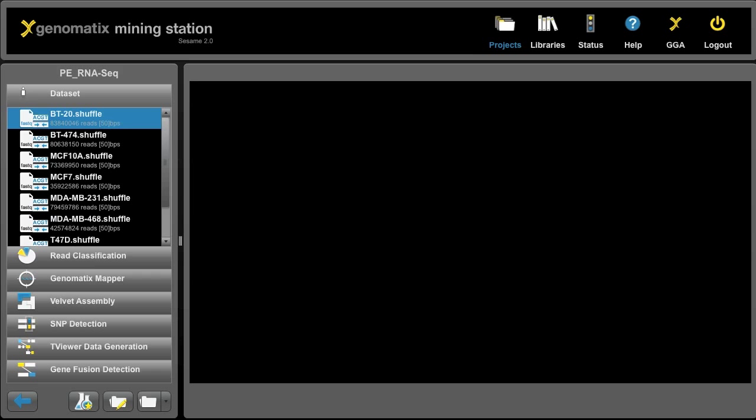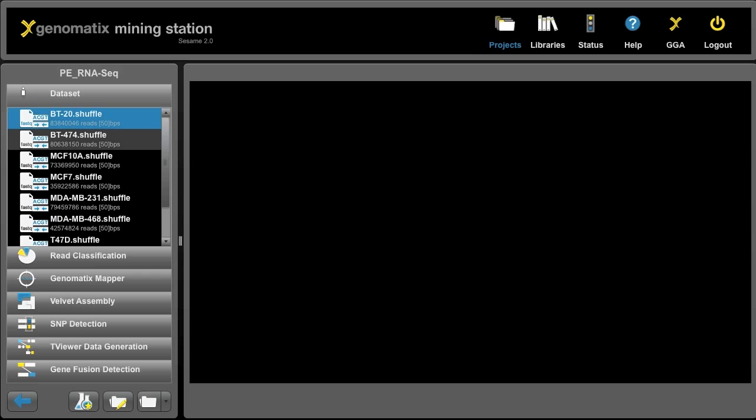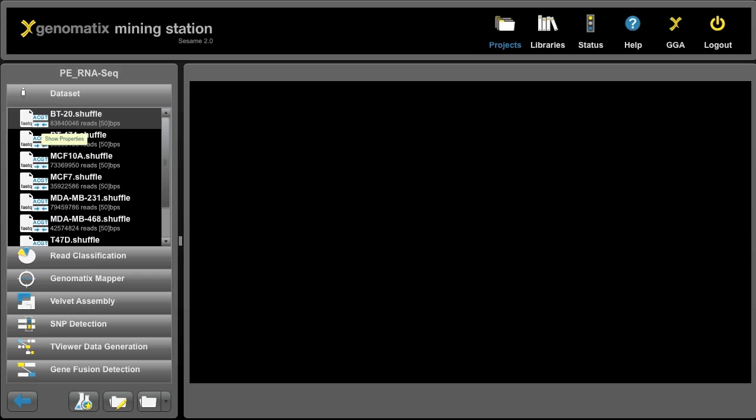To the left you can see the dataset of the project, where we have several read files that were provided to us by Illumina, and they are taken from several breast cancer cell lines like BT20 and BT474. To the left you can see the type of file, FASTQ, that it's base coding and that it's paired end data.